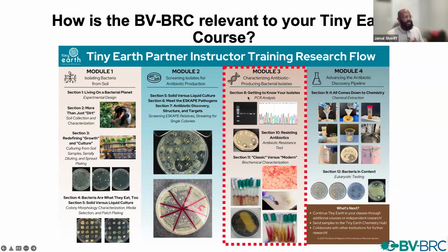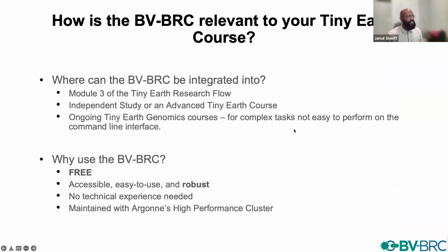Depending on the size of the course and how much time you have, you could perform metagenomic sequencing, be able to look at your isolates a little bit further, as well as get a clear identification of what your isolate might be. All right, so as I just mentioned, the BV-BRC can fit well within Module 3 of your Tiny Earth research flow.